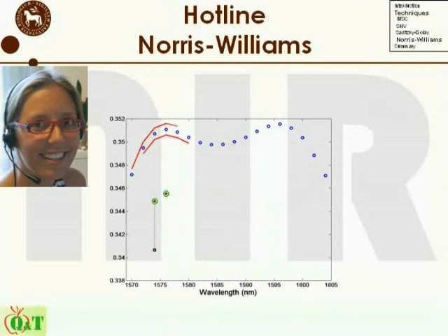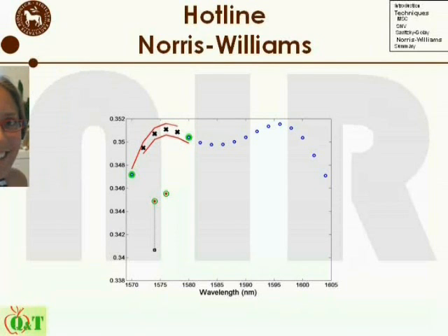These 2 points, however, are calculated as the average of 5 points, 2 points on each side. The estimate of the derivative will therefore simply be the difference between 2 points, 5 measurement points apart, divided by 5. This means that the only effect the smoothing step has had is scaling down the estimate of the derivative in comparison to using the raw spectrum. If the gap size is larger than 1, the smoothing will have an effect.